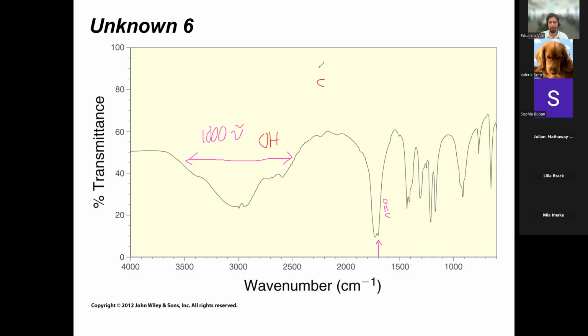What is the name of this functional group? And we also saw it earlier. So again, you got to be able to tell me this on the quiz and you got to be able to tell me this on the final and next semester as well. What is this functional group called? Carboxylic acid. Yep. So you say, I have a carboxylic acid in my compound.